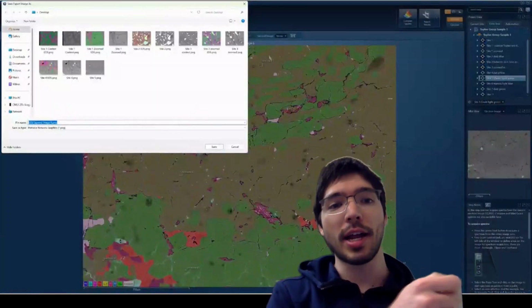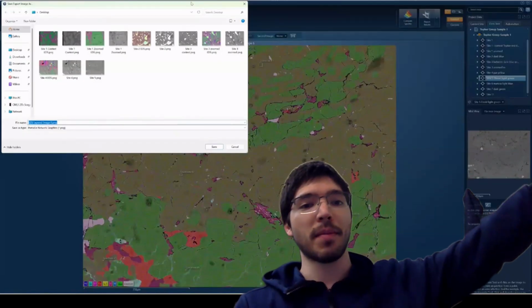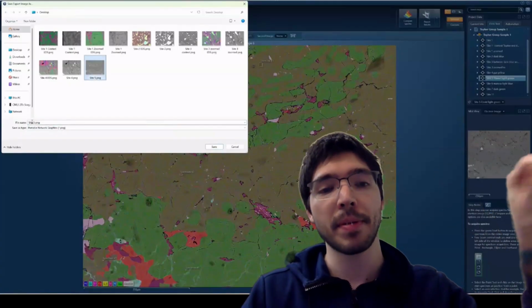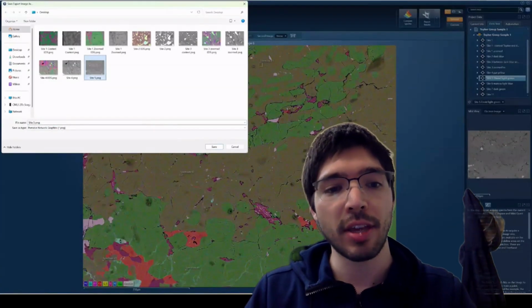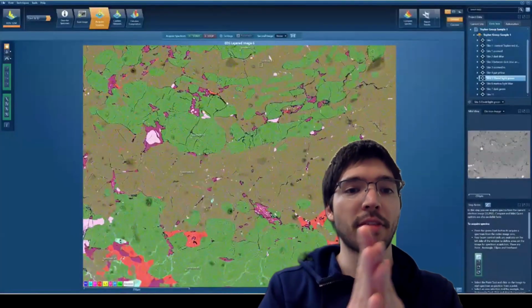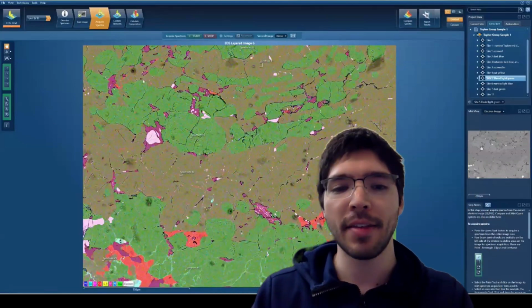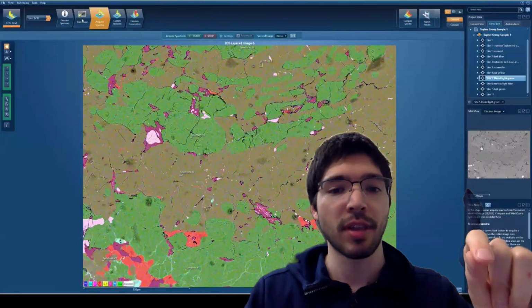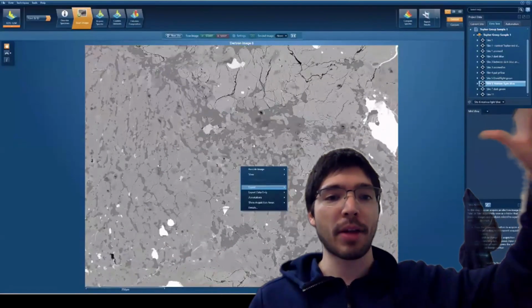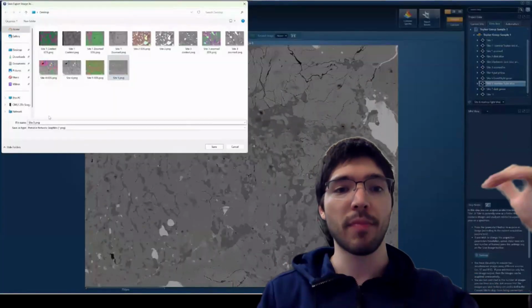Depending on what element you're looking at, these are called characteristic X-rays that can get picked up in our X-ray detector, and they can tell you exactly what element is being picked up. You can use this as a proxy, depending on the energies of these X-rays, to tell you what elements are present wherever you're scanning. So to simplify that, we can go to any point of interest on our sample, we can get data, and it'll give us the energy spectrum for all of those characteristic X-rays and background X-rays that are picked up from that area.